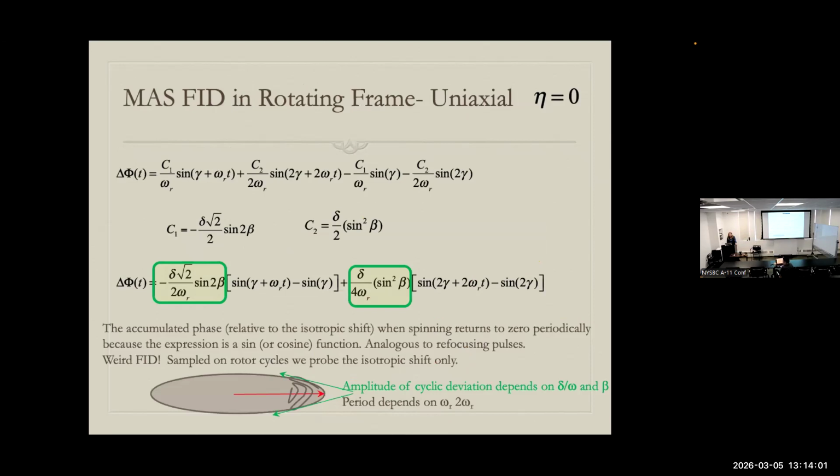A picture that was hand drawn and undoubtedly wrong, but it's a picture. So this equation talks about sinusoidally varying phase, so we're in an XY plane.